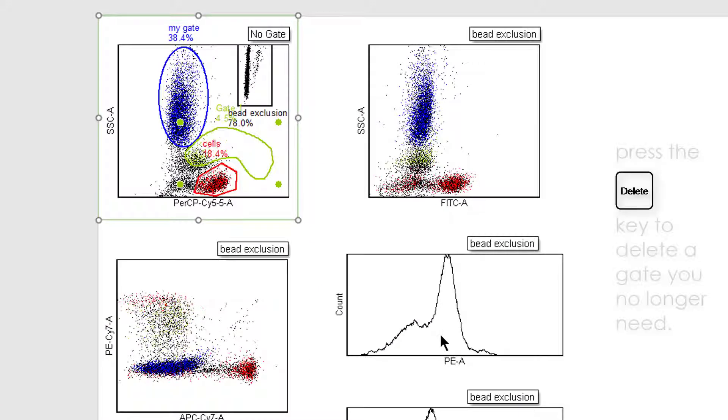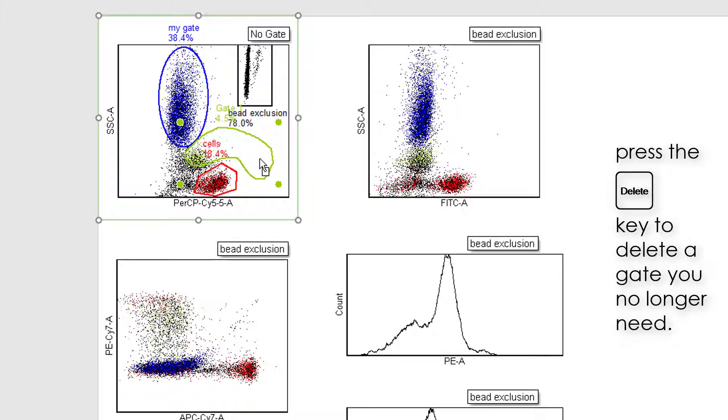To delete gates, simply select the gate and click Delete on your keyboard.